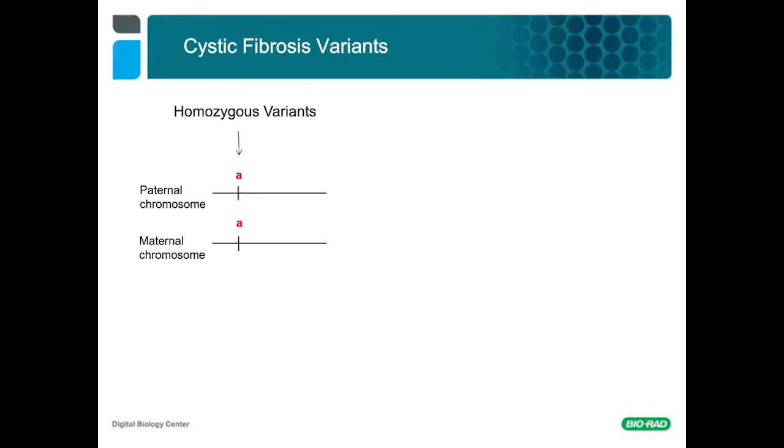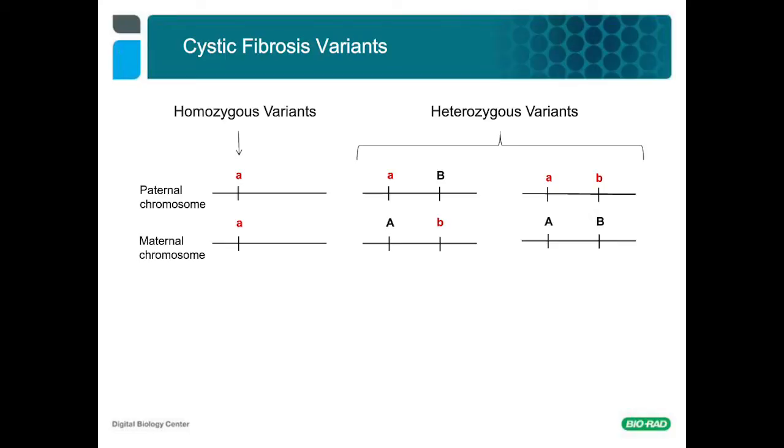When diagnosing cystic fibrosis from a genetic standpoint, several genotypes can be observed. The easiest genotype for predicting clinical outcome is when a patient is found to be homozygous for a particular variant, since it is clear that both copies of CFTR are compromised. In contrast, if a patient is genotyped to have two heterozygous variants, then this individual could have variants that are either trans or cis configured. This creates some ambiguity, as these haplotypes are clearly different and may result in very different disease states.